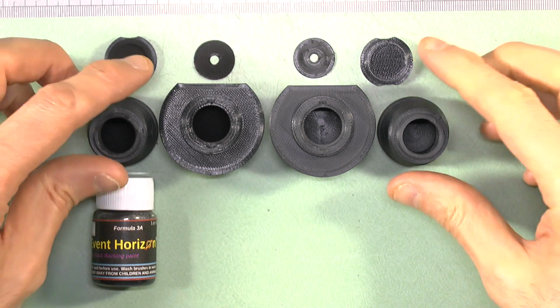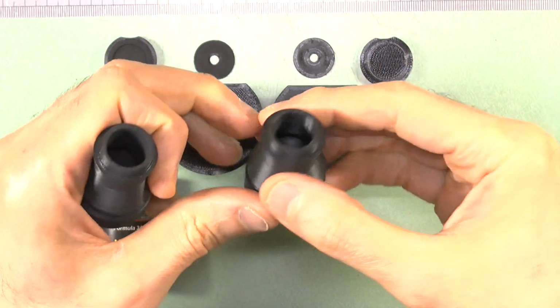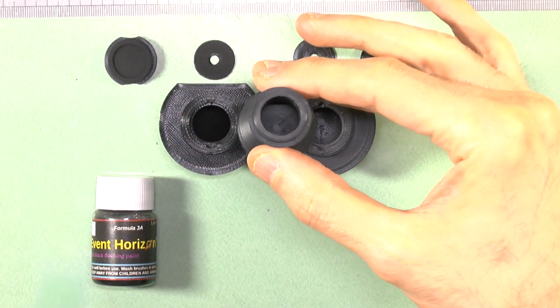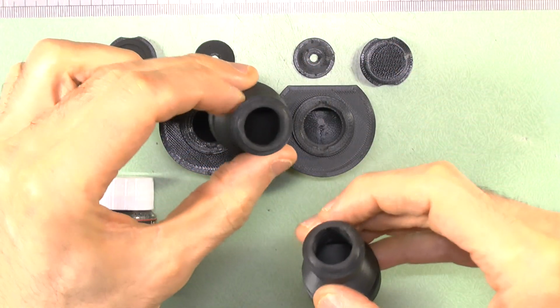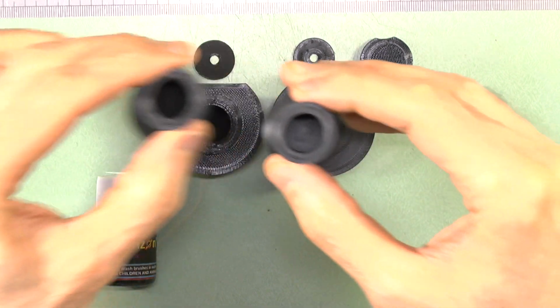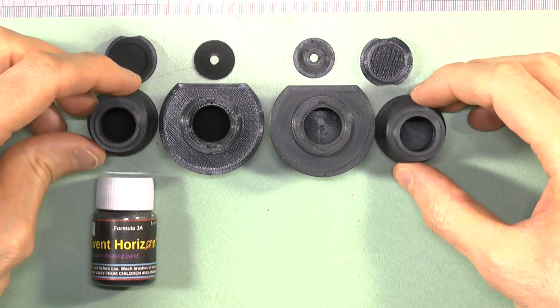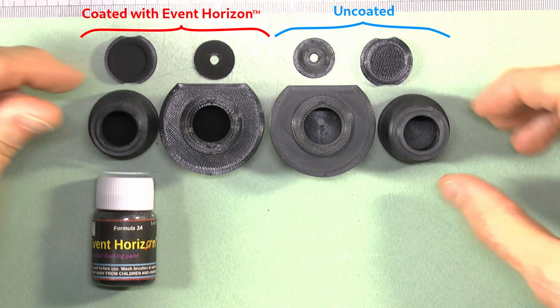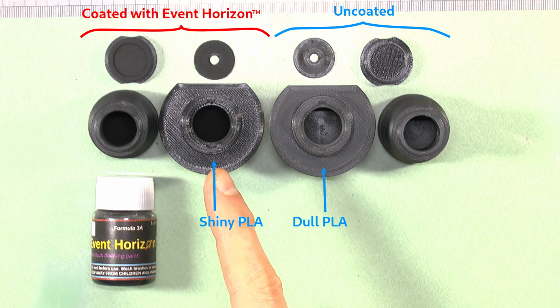These light sink modules, which I also call black holes because of their function, give some benefit just as they are. However, their effect can be improved if their internal surface is coated with matte black paint or flocking that is darker and more matte than the plastic used to print them. This is especially important if you use a more shiny variant of black 3D printer filament, as shown in this comparison.